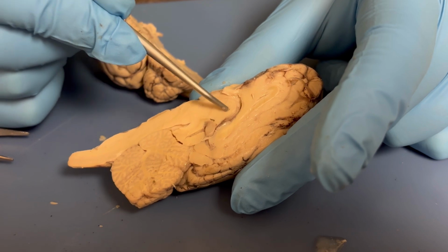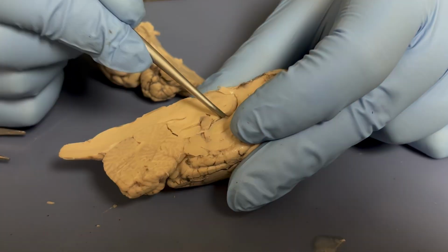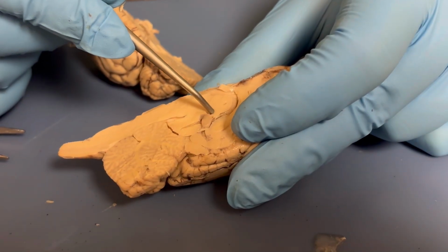Next, we have the ventricles. The lateral ventricle is in the middle of the brain, and the third and fourth ventricles are located around the midbrain area. These ventricles are areas where cerebrospinal fluids circulate around the brain.